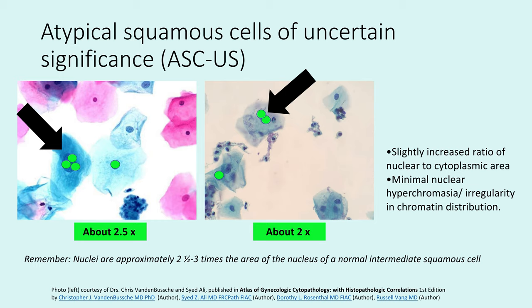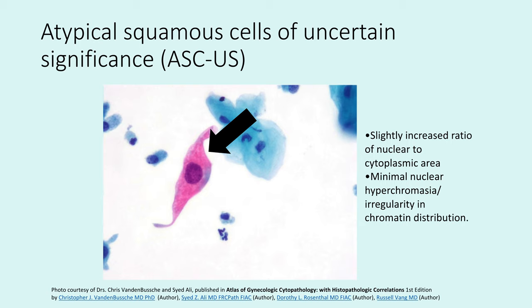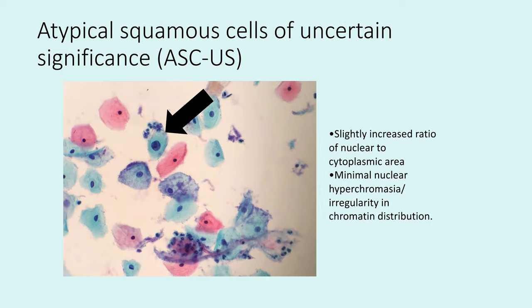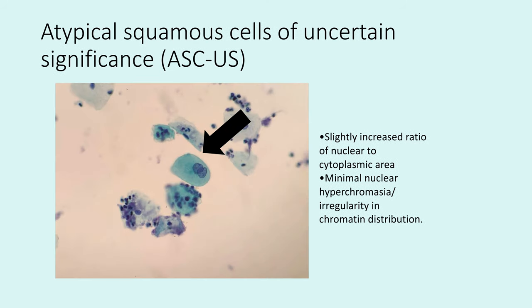Another example of an ASCUS cell shows increased NC ratios and some chromatin changes, but no really good HPV change or irregularity of the nuclear membrane. Another cell almost looks a little bit metaplastic — once you start seeing metaplastic cells, you might worry about an ASC-H diagnosis. However, there is too much cytoplasm in the cell and the NC ratio is not significantly increased, so an ASCUS diagnosis is appropriate here as well.